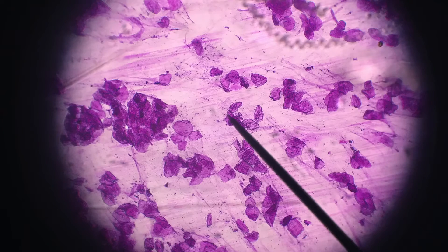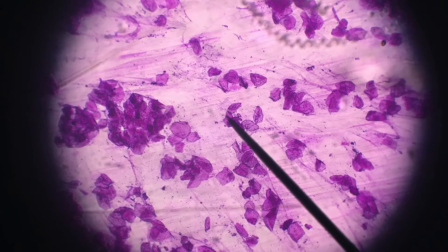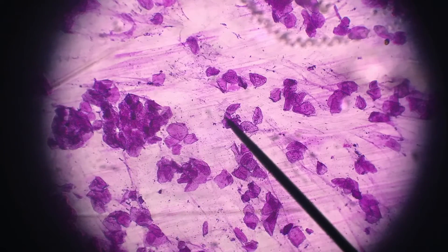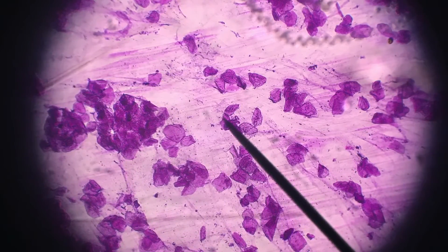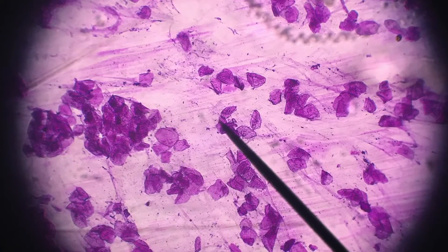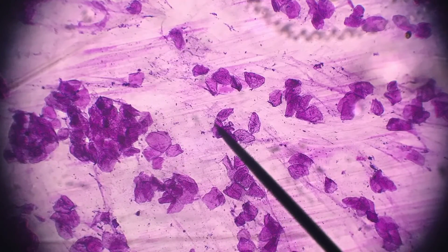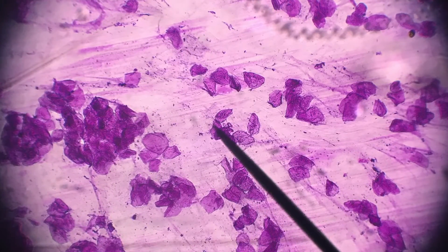So that's it — that's the cheek cell. I've been doing this lab for well over 20 years and it still fascinates me. I just find it so amazing that there are these tiny little living things, all these separate little living things, that are all pieced together like a puzzle — how they all work together to create you or to create me. Just mind-blowing.